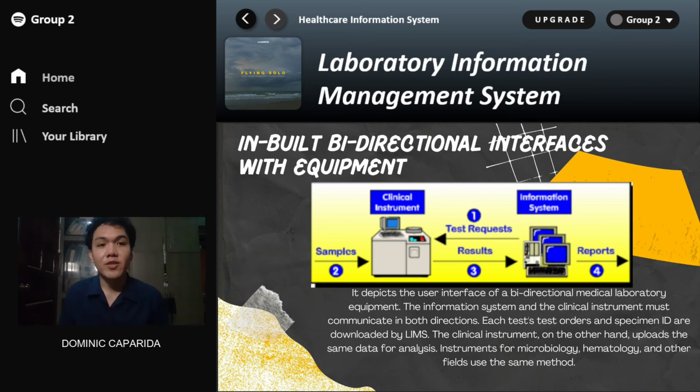So first, the information system will request tests on the clinical instrument, and these clinical instruments are presented with samples. As the samples are being analyzed, after that there will be a delivery of results. Then these results will be passed through the information system, and this information system will report to the institution, for example the doctors.